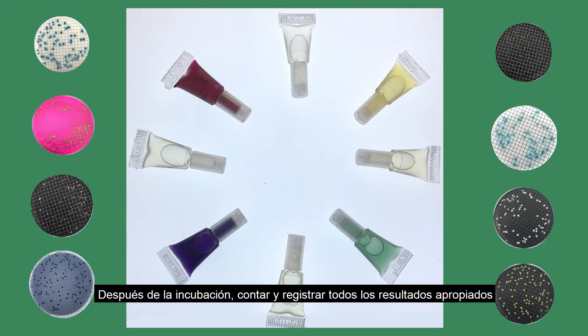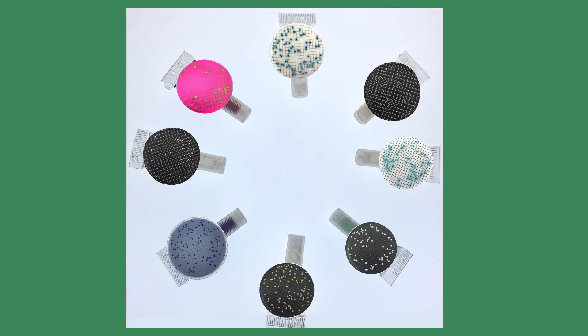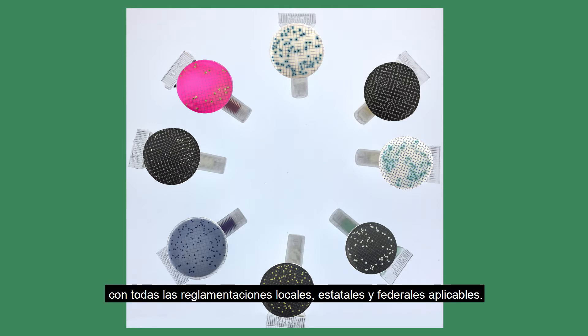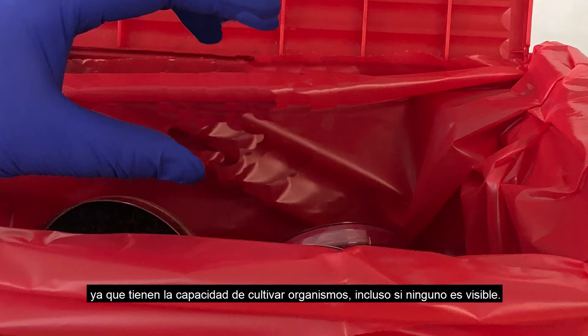Following incubation, count and record all results appropriate for your chosen media. Dispose of the plates in accordance with all applicable local, state, and federal regulations. The used monitors should be treated as biohazardous waste since they have the ability to grow organisms even if none are visible.